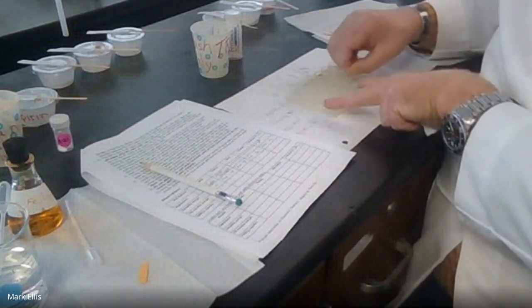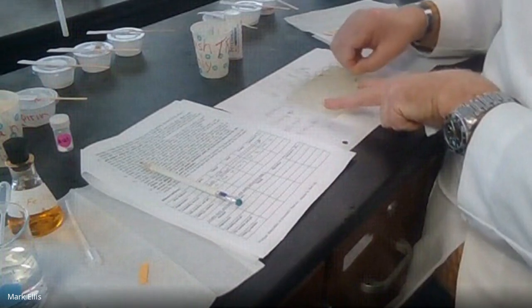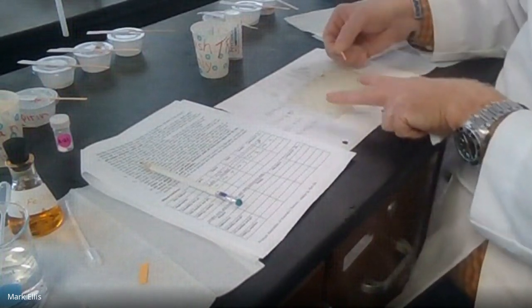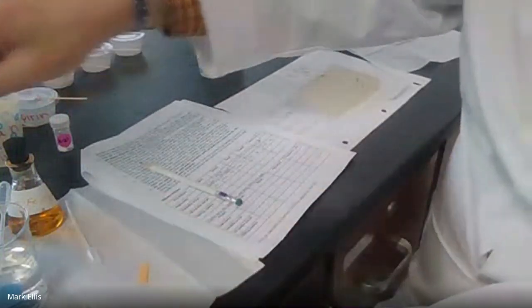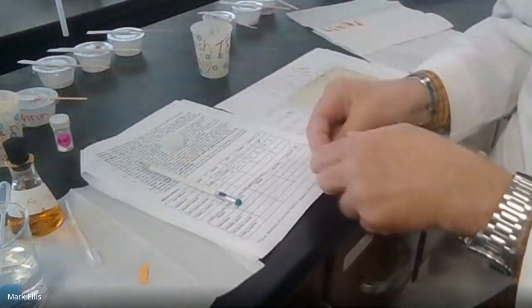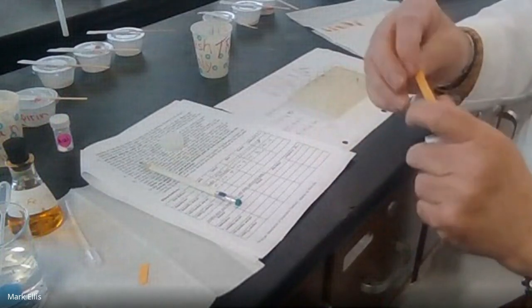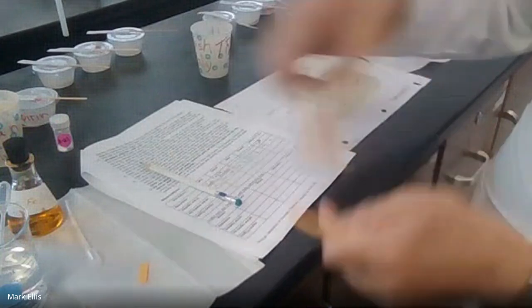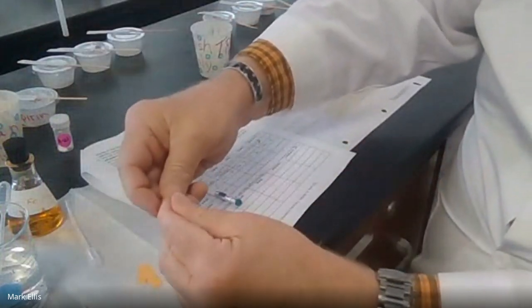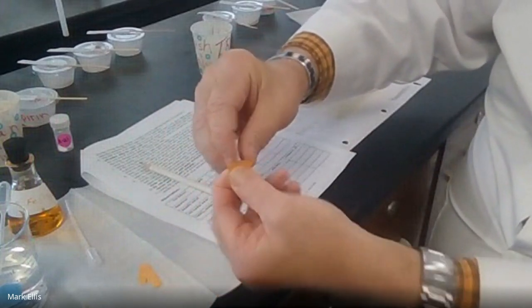And if I had a lab partner, they could be getting, looks like I got maybe 1 or 2 strips of pH paper left over there that I already tore from the second step. So I'll need about 3 more. So if I had a lab assistant or lab partner, they'd be getting out a few more strips. I think 2 more should do it because that will give me 4 plus 1 is 5. So again, tearing them in half. A good old lab partner helping me out, working fast.